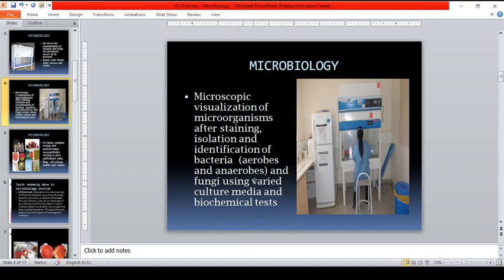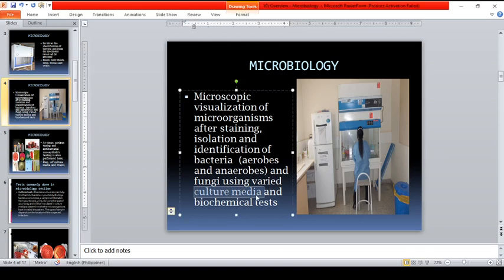So guys, if you remember from our previous discussion, we mentioned the commonly used materials, equipment and machines. We mentioned the use of culture media, and this culture media provides the nutrients for the bacteria to grow. Bakit nga ba natin kailangan ang culture media in the bacteriology section?